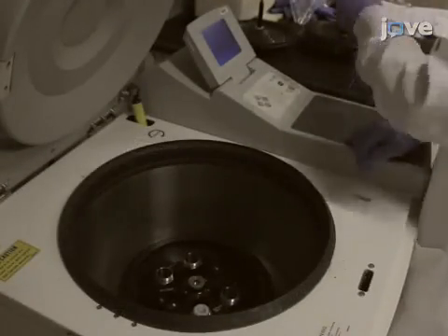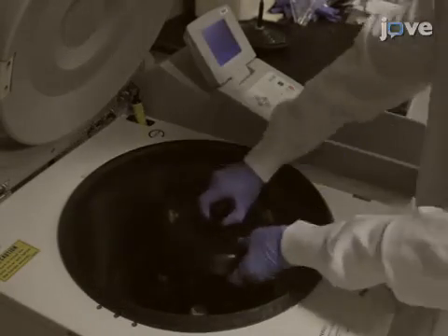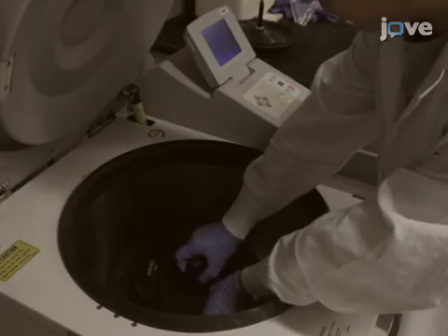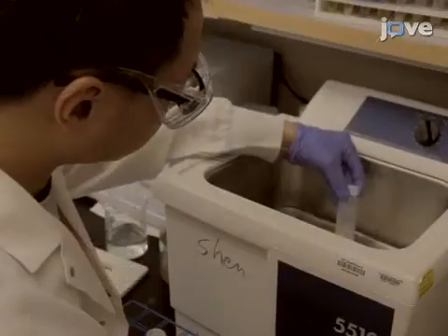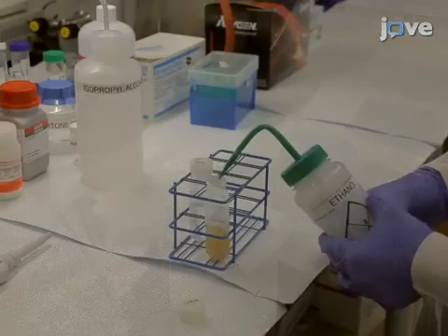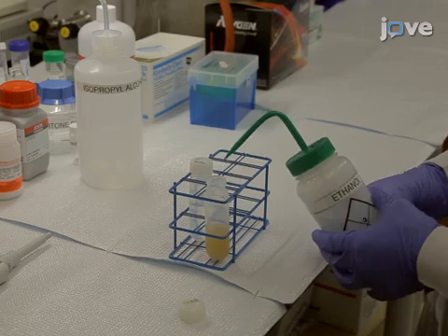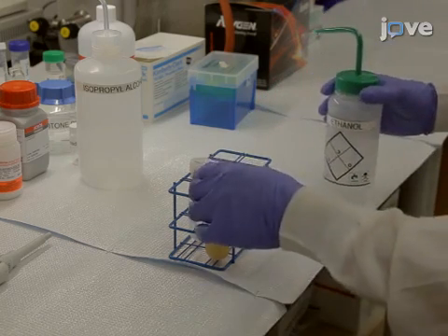Transfer the particles to a centrifuge tube and centrifuge the solution for 30 minutes at 18,800 times G. Following centrifugation, resuspend the pellet in isopropyl alcohol using brief sonication. After repeating the centrifugation and washing step with isopropyl alcohol and ethanol, leave the particles in ethanol until ready to use.